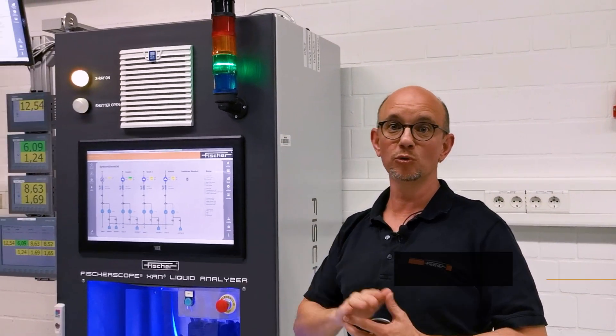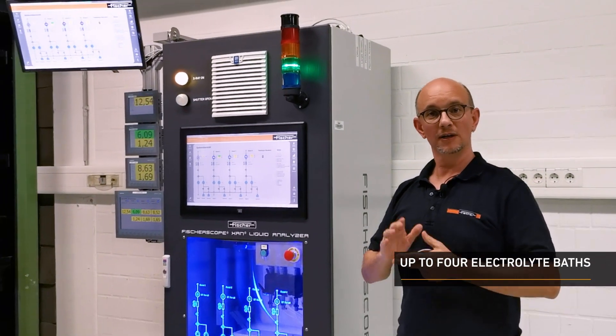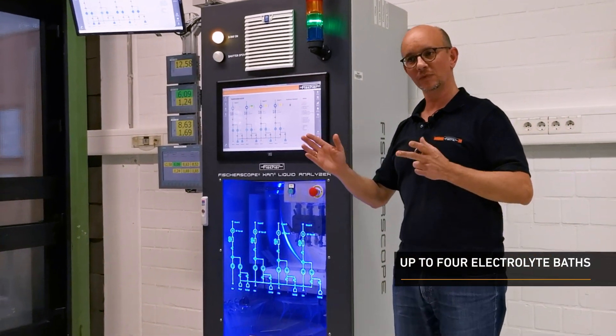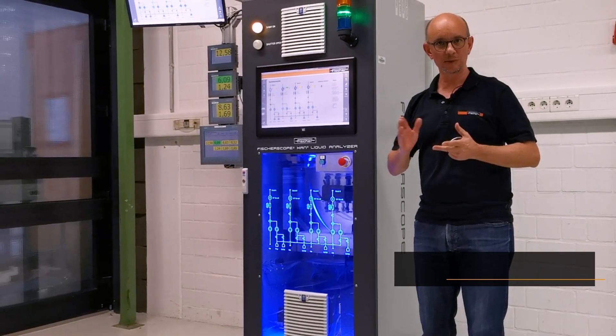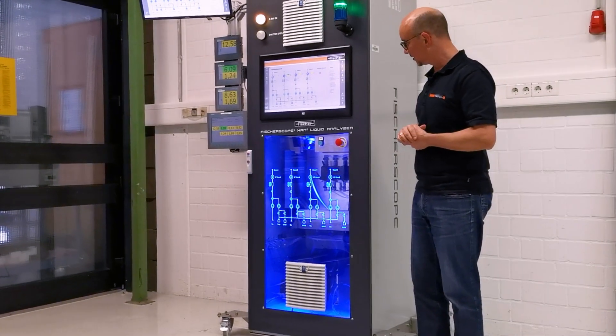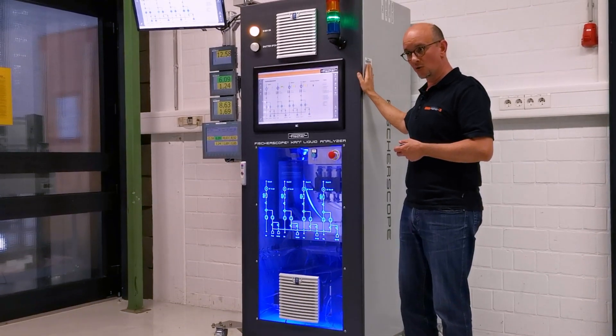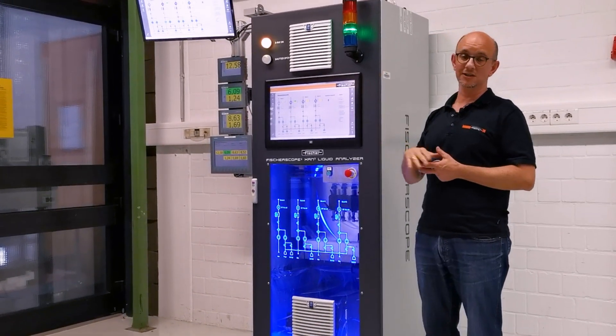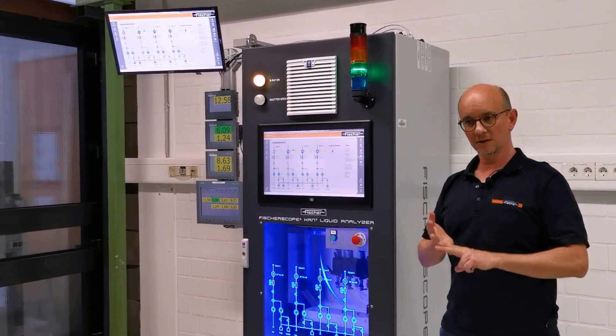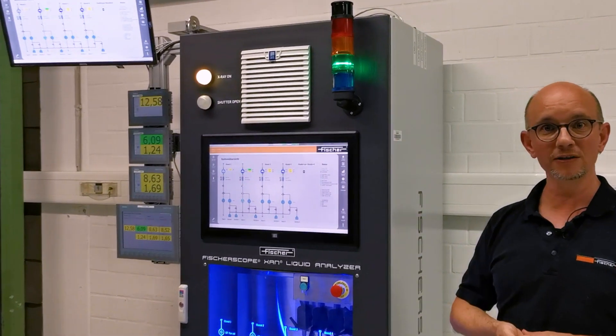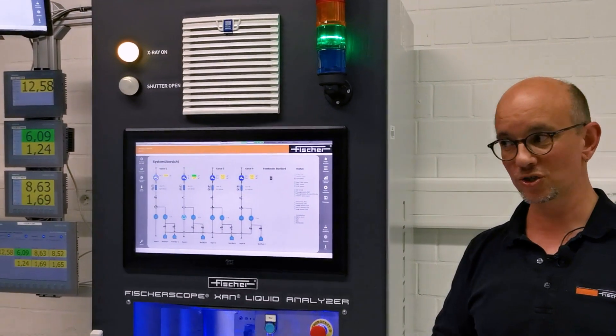We are measuring metal concentrations in up to four individual solutions. These could be your four individual plating lines connected to the instrument. You can use the instrument locally on the shop floor or in a central laboratory room. We have different options of cooling addressing different ambient conditions.